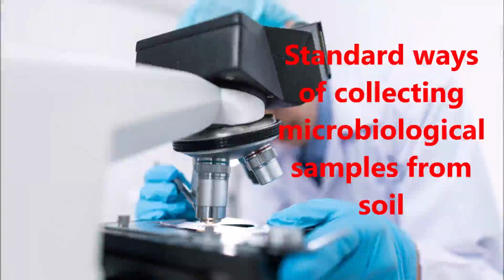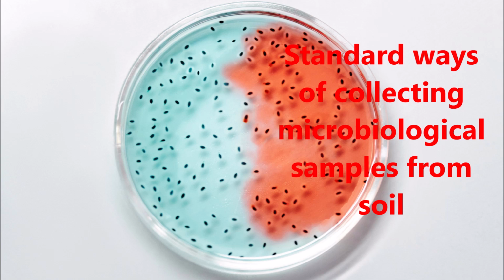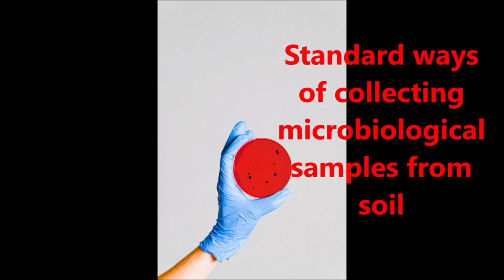Standard way of collecting a microbiological sample from the soil, which I will start with an introduction of the soil. The soil is a naturally occurring mixture of minerals, organic matter, water, and micro or living organisms.